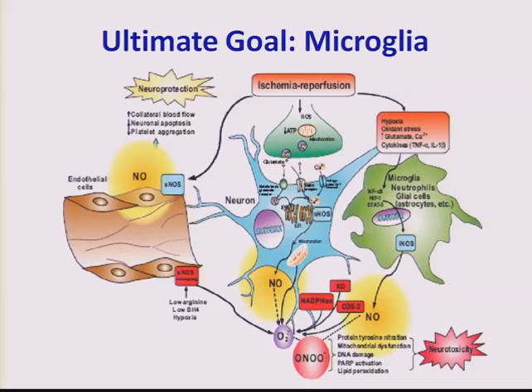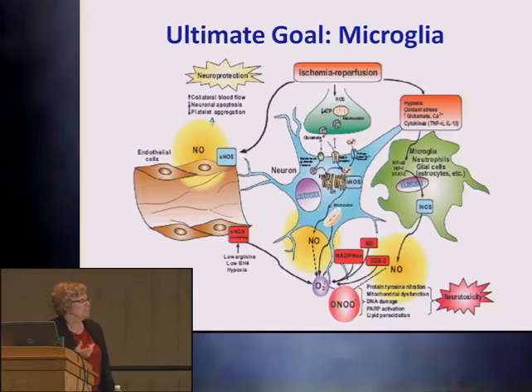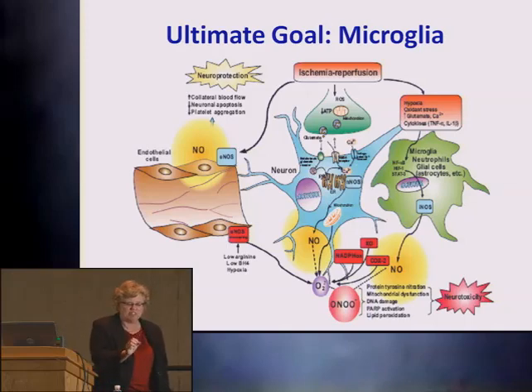And the idea would be to bring the cells into the single cell analysis system and lyse them in the channel. They'd be lysed in a high pH buffer, and they'd only spend less than a second to be lysed, and then injected into the separation channel, where they would be separated immediately at a high pH. So we're hoping that because of the short time between the lysis and the actual detection, and the fact that we're using a high pH, we should be able to capture peroxynitrite and some of these other reactive oxygen species in single cells using this approach.